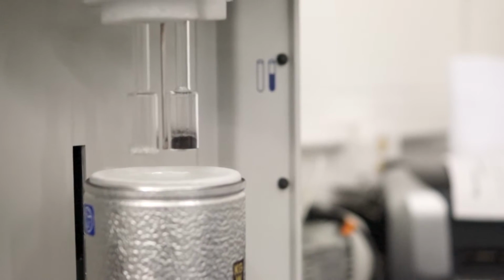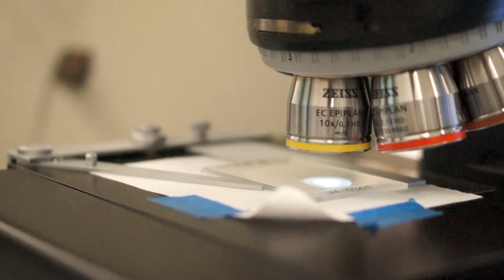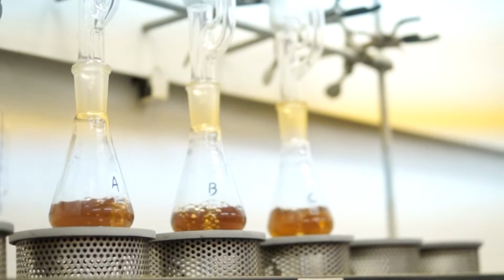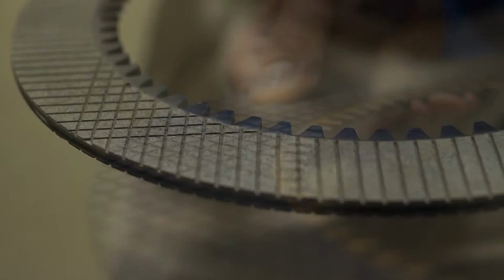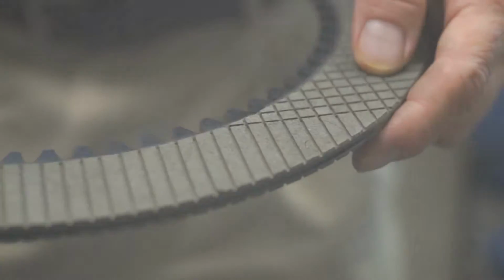This is where we conduct a lot of development and testing of the actual materials. We have optical microscopes. We also have a scanning electron microscope. And then we have some other test equipment for measuring thermal conductivity and a differential scanning calorimeter, which is used to measure when resins cure and how long they take and what temperatures they cure at. And then we also can do TGAs, which allow you to fingerprint friction material and be able to identify it at any point in the future.